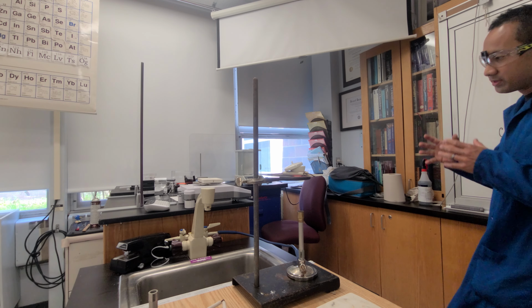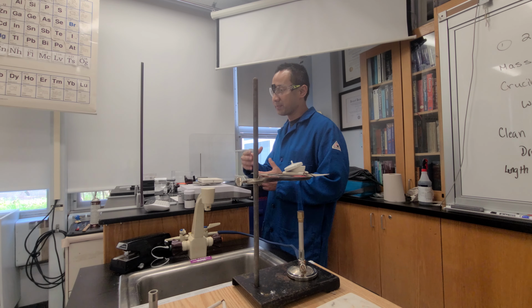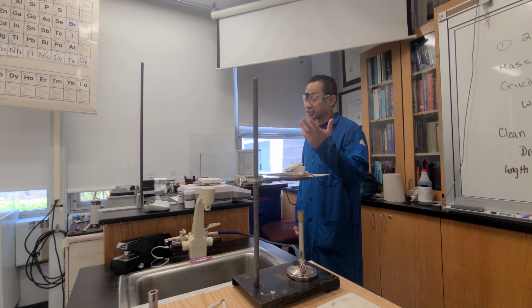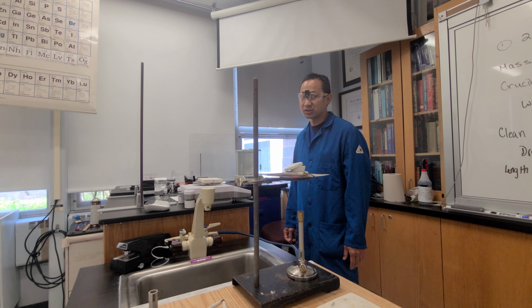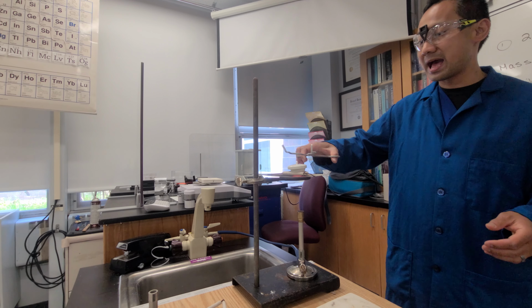One of the issues is that if you continue to let it cool down, your mass is going to change. It takes too much time to do. And so we're going to be taking these measurements while they're hot. We took an initial measurement when it's cold, and we'll do our final measurement cold as well. But these intermediate measurements, we're going to do essentially hot, okay? And that is the sacrifice that we have.